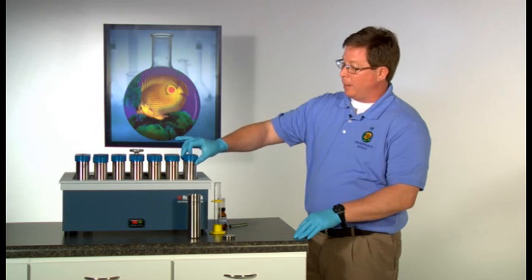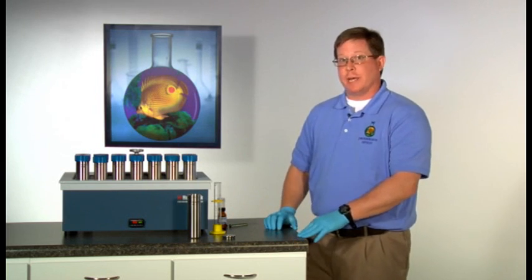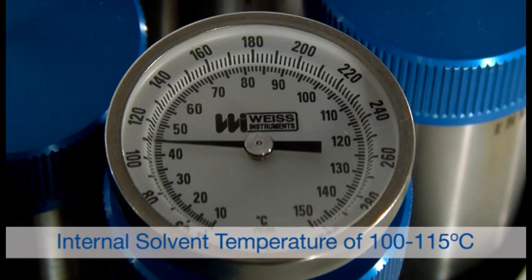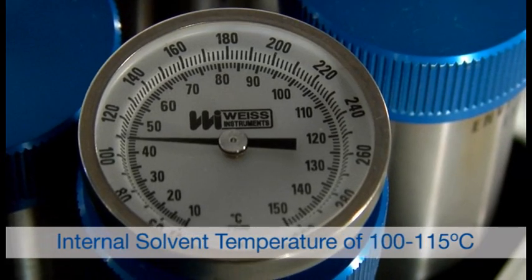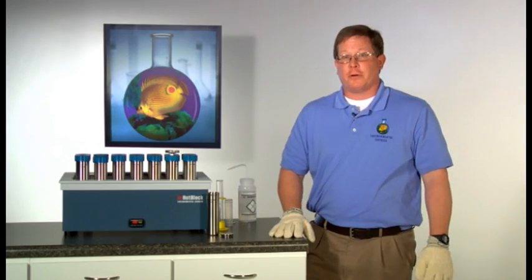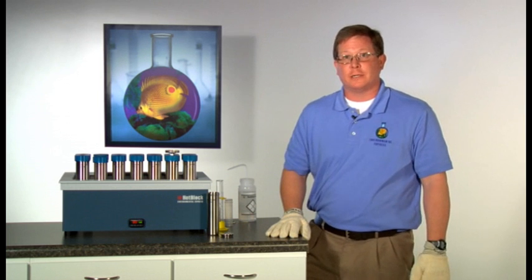Place the cell into the hot block. The hot block should be set at 130 degrees Celsius. This will provide an internal solvent temperature of 100 to 115 degrees Celsius, which is required by method 3546. Samples should be heated for 30 minutes at the 130 degrees Celsius set point.